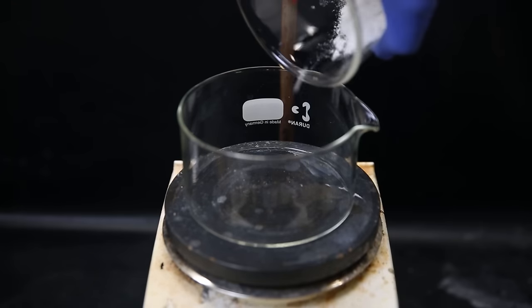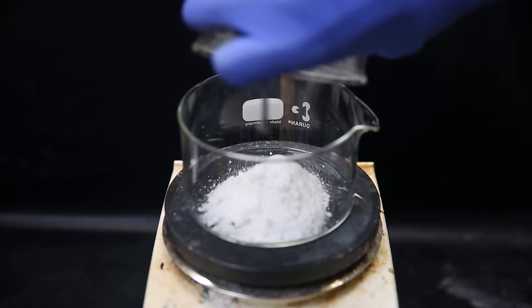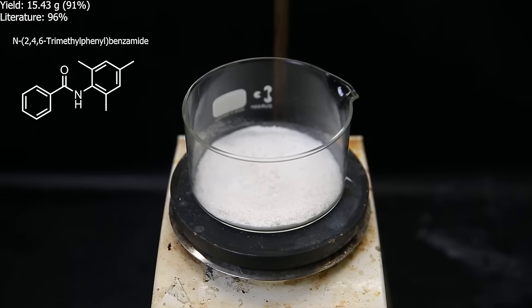Afterward, I was left with the product as a very white crystalline solid, but it is still wet with some ethyl acetate, so I set it in the oven to dry for a while. And after that, I am left with 15.43 grams of the product, which is a yield of 91%. This yield is similar to the literature, and I can immediately use the product to move on to the next step.